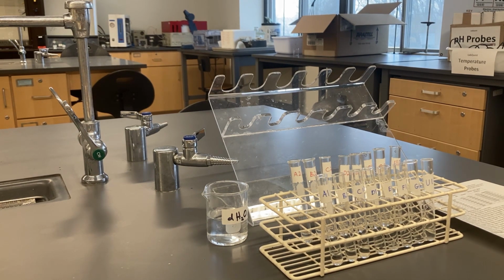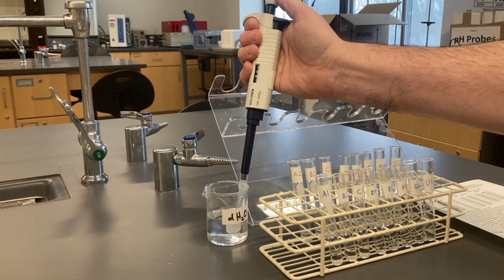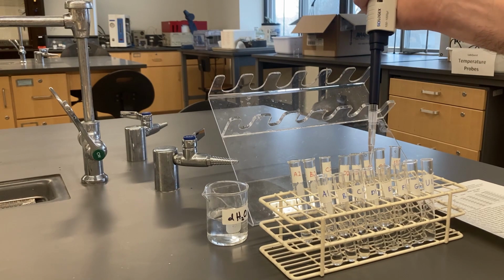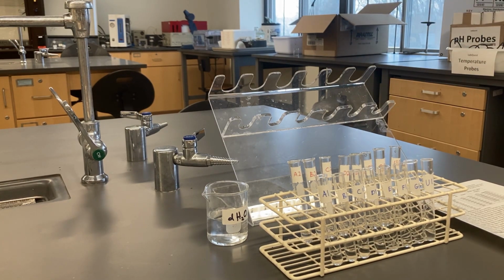D1. And the E1 is going to get 900 microliters of distilled water.